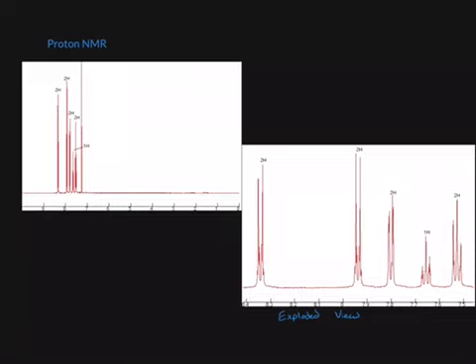So now, we're going to attempt to draw the structure of what we believe the molecule looks like. We know that we have rings, we know we have carbonyl groups, we know we have nitrogen-oxygen bonds, and we have relative symmetry. So we'll start with drawing our rings.